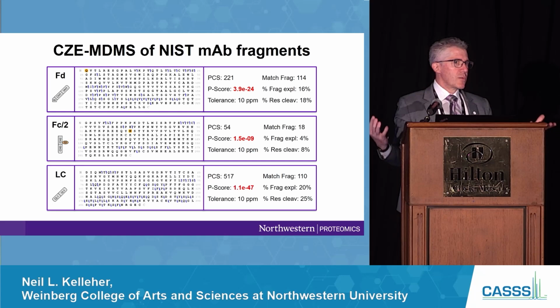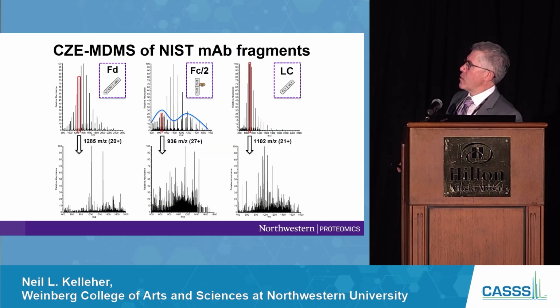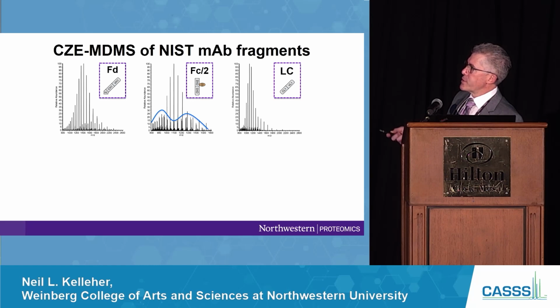That's one way in which this field is maturing pretty rapidly, at 25 kilodaltons, right in the size range of all of these pieces.